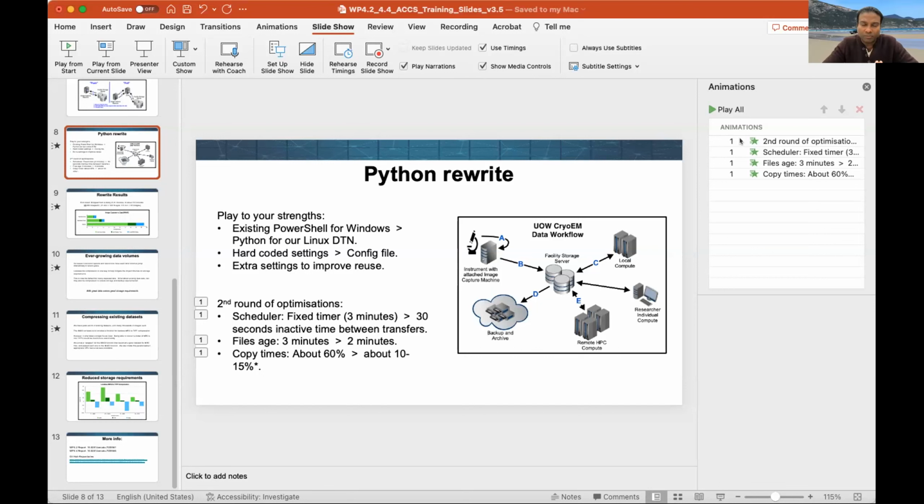And in terms of the volume of data that you are able to handle, is it in the order of terabytes? Oh, yeah, multiple, like tens of terabytes. We use this not just for the images coming off the capture machine, but we now have it running for our backups as well across to the S3 storage, and that's hundreds of terabytes. So for example, if you take 100 terabytes, how long will it take to transfer from one point to the other? You can define the points.